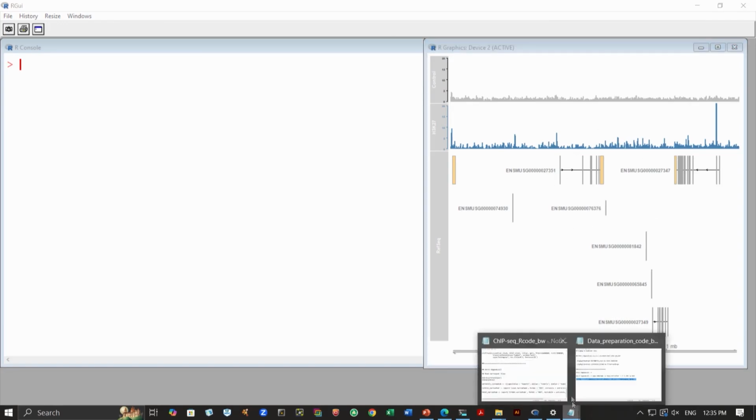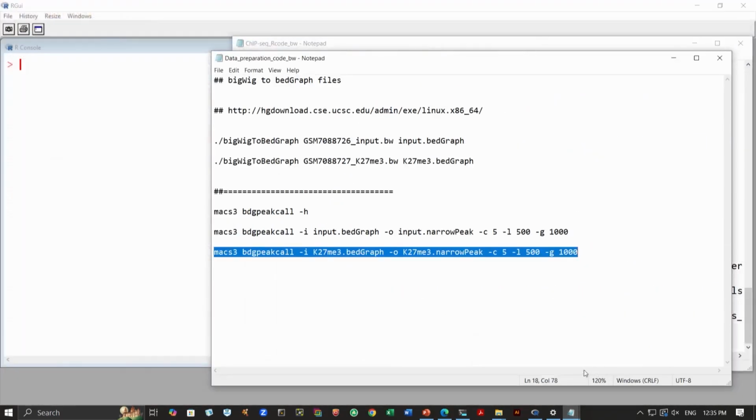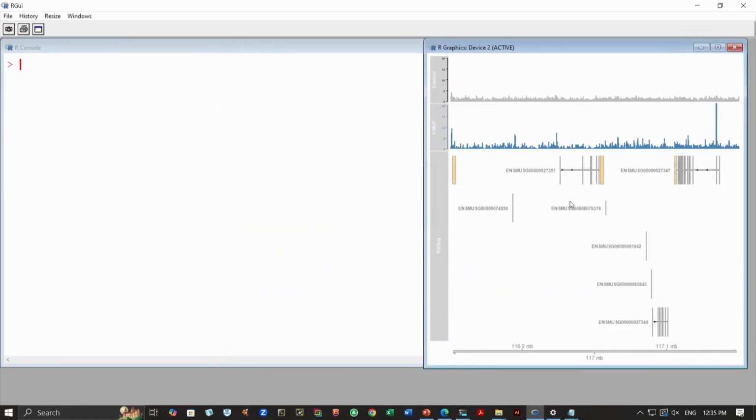Okay. So, once we have loaded this narrow peak data, we can actually put them here in this visualization in R. We define these annotation tracks and we can put them as box as before. I am not going into that file, we can actually put this back. What you will see is that some of these will not make much sense, because again we have not optimized the parameters when we are doing the peak calling. That is why we always prefer to start with the BAM files, starting from the raw data BAM files and then finally to the peak calling part.